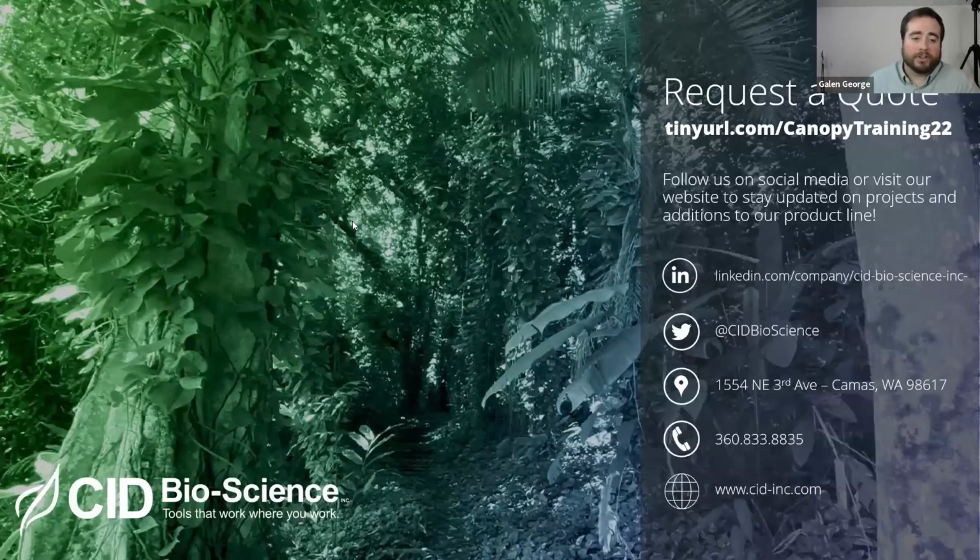PAR LAI is measuring the photon flux and using a whole separate calculation to calculate the LAI based on that, as well as other parameters like the sun zenith angle and the leaf area distribution. So that is the difference.